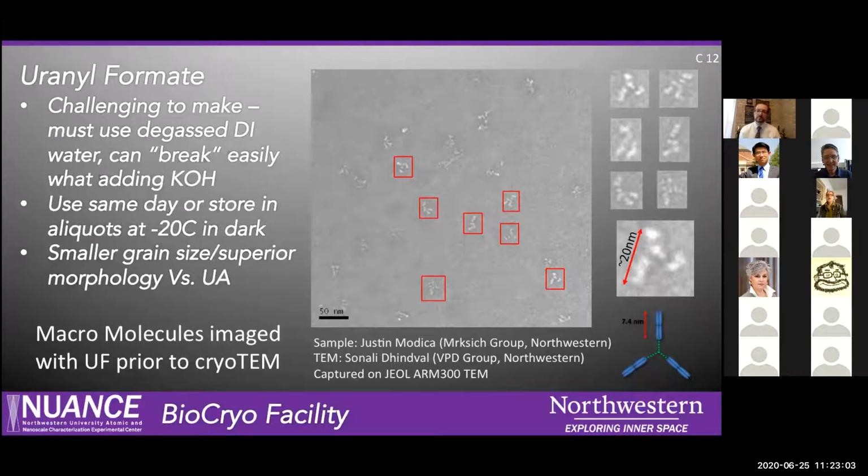But let me tell you, the trade-off of that grain size is worth it for the superior morphology that you can distinguish with the uranyl formate. It's one that I have been using much more frequently.